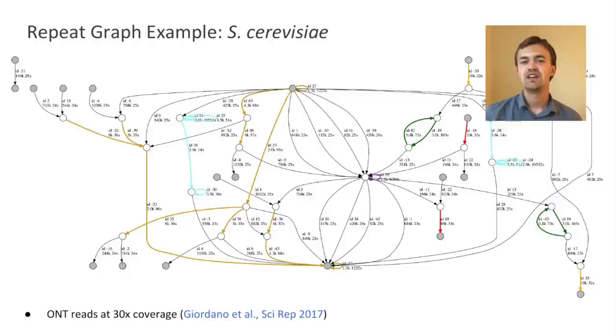So as an example, here's an assembly graph of a yeast genome assembled from Oxford Nanopore reads. Black edges correspond to the unique sequence and colored edges are large repeats. So those black edges will be your contigs. And I wanted to highlight some other useful features of this graph, such as these two nodes correspond to telomeres. They have either a high in-degree or high out-degree. There is this node that corresponds to unresolved copies of Ty1 transposon that is abundant in this yeast strain.